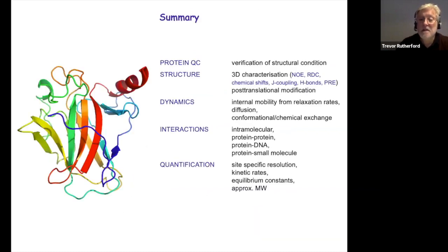There's the overall summary slide that is showing that we're looking at the protein QC, we're looking at structure and dynamics, we're looking at intermolecular interactions and the quantification of rate constants and exchange processes.